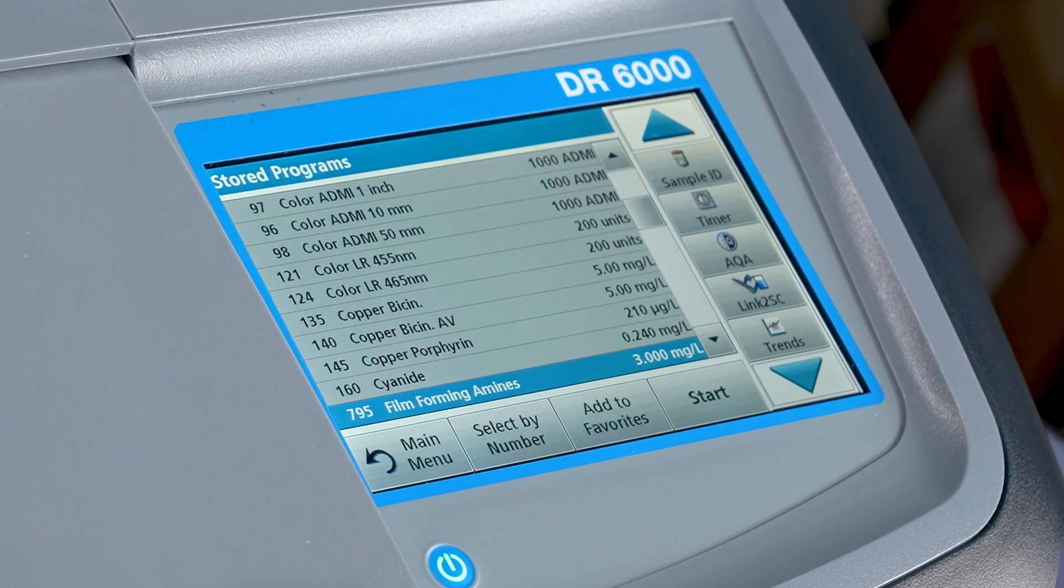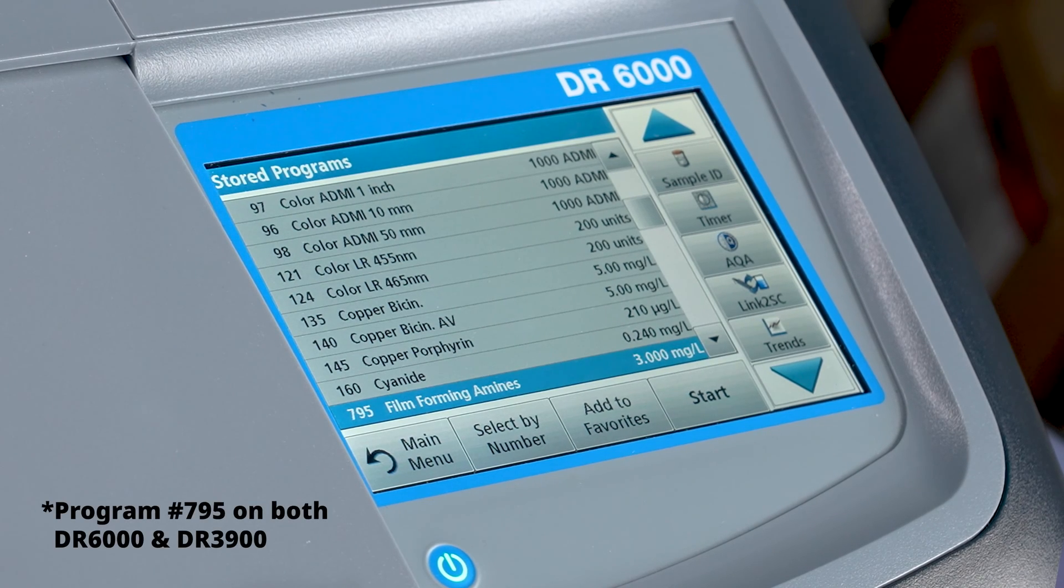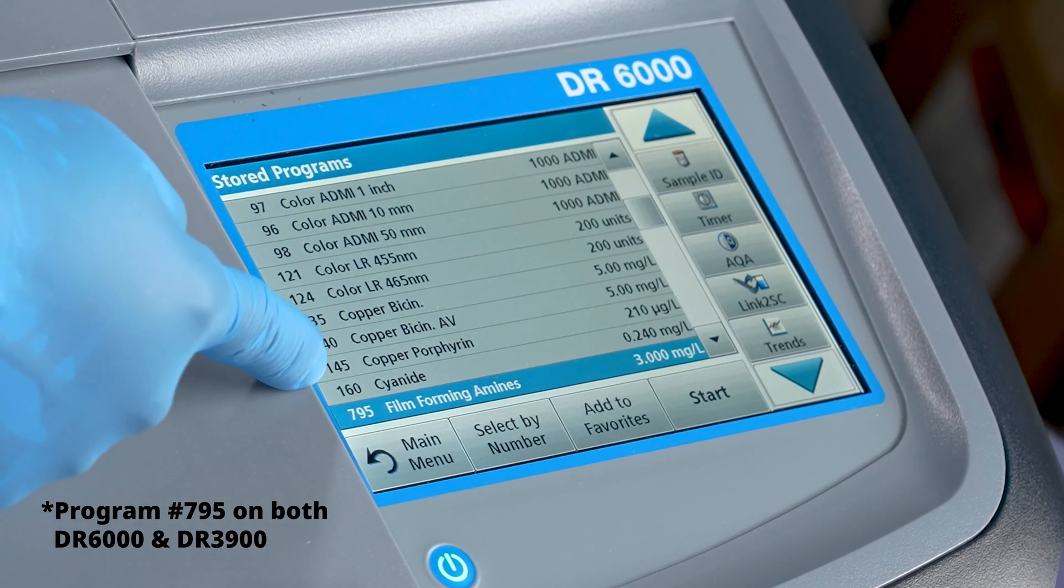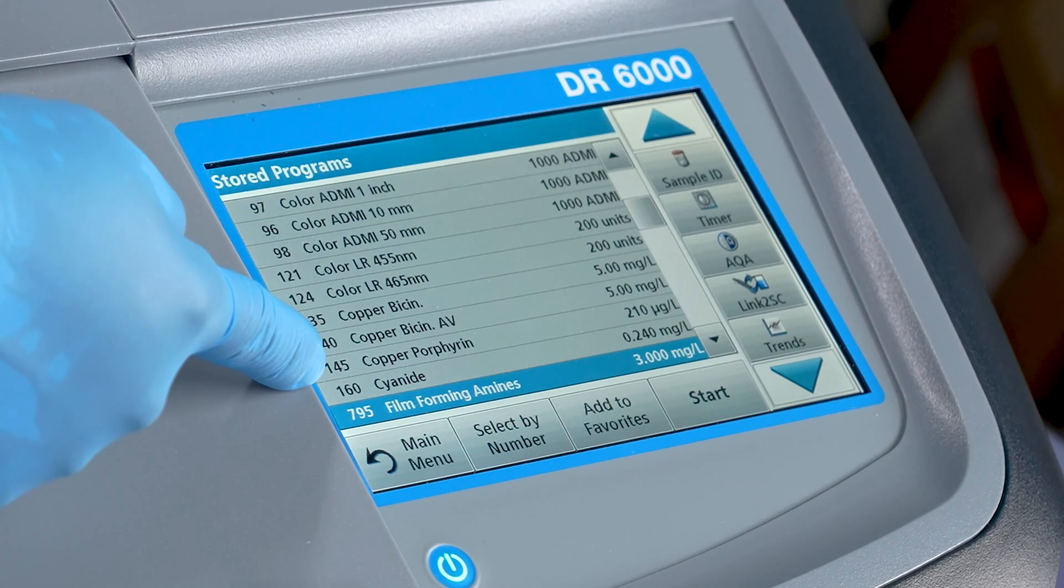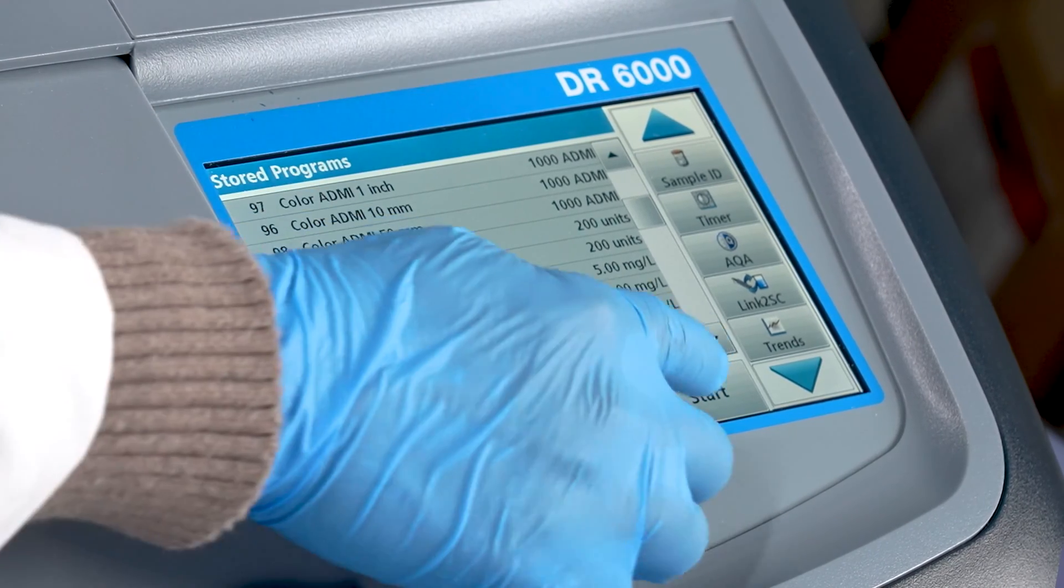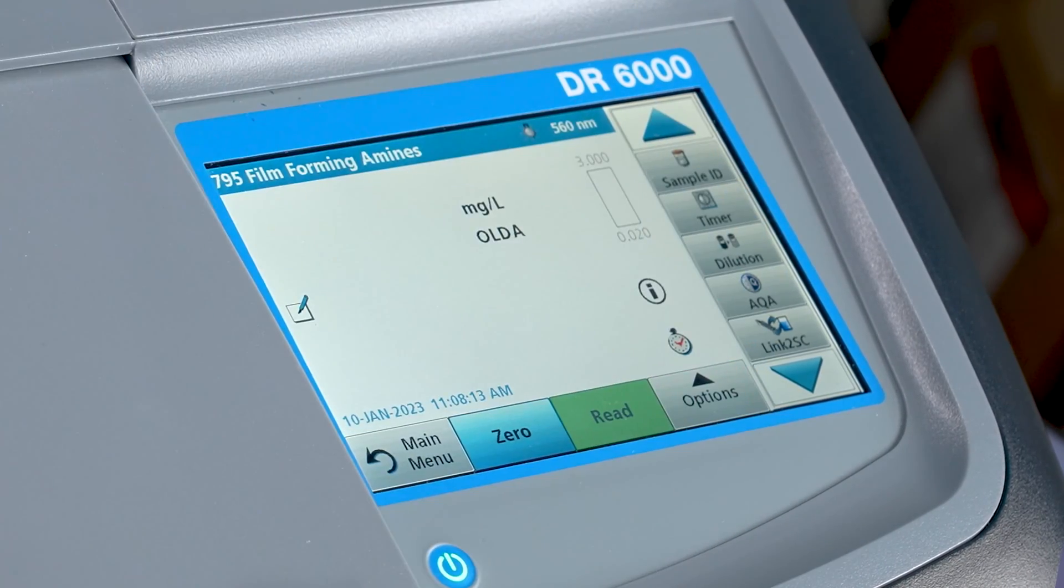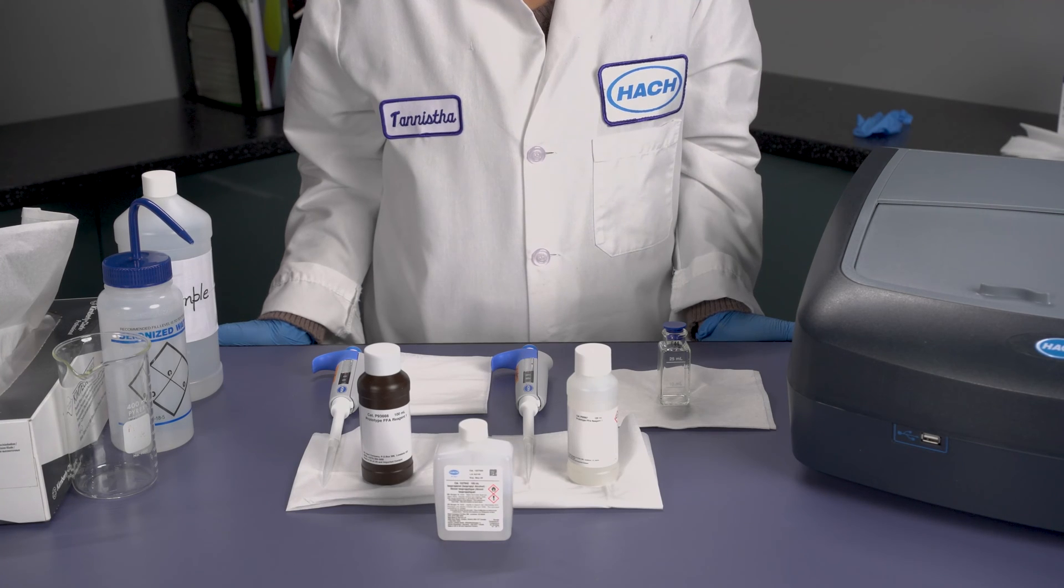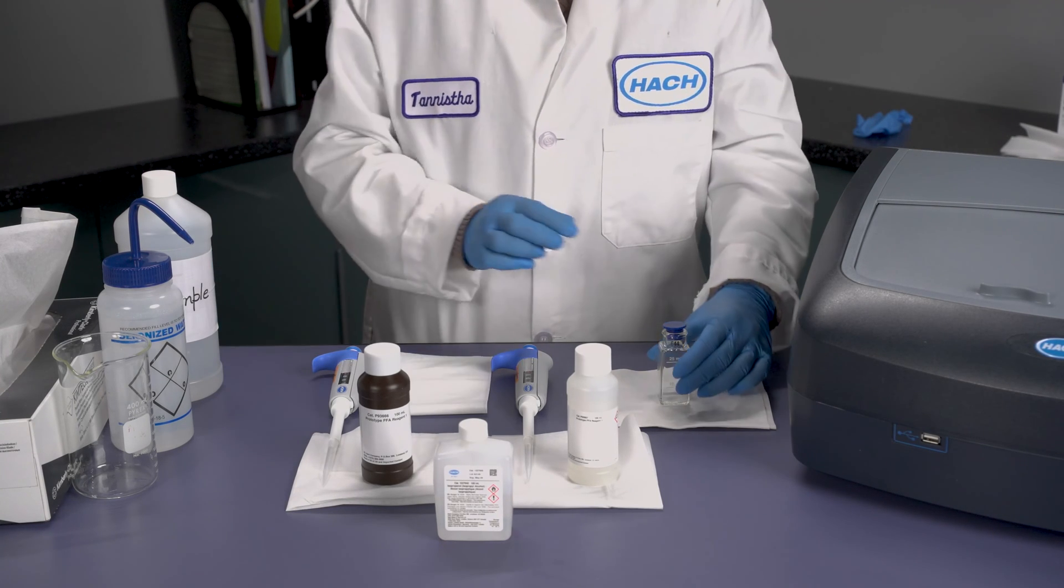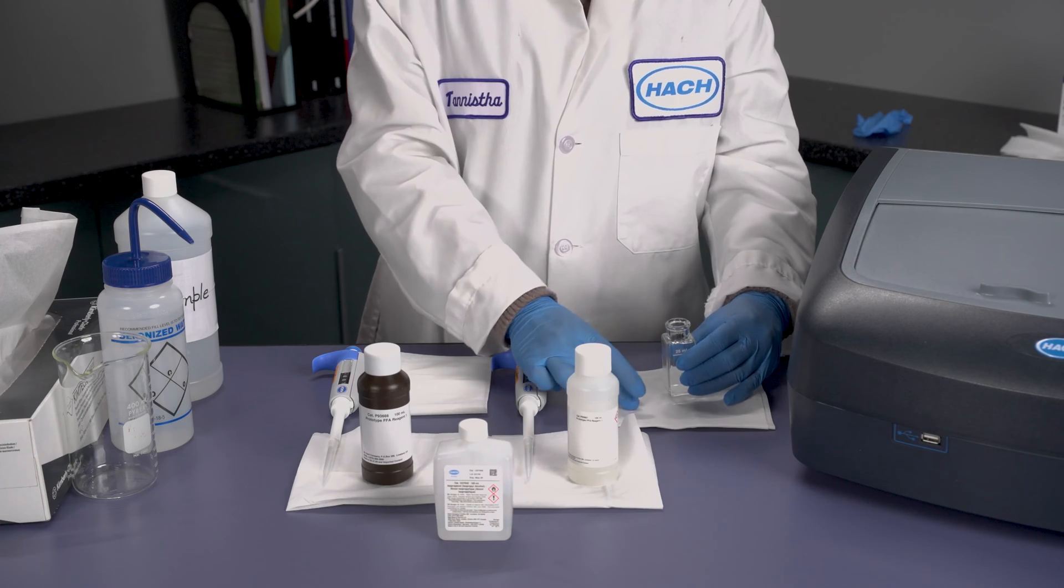To perform the method, first we need to select the proper program on our DR6000 spectrophotometer. This is program number 795. To perform the test, first we need to rinse out the 25 ml sample cell with deionized water.